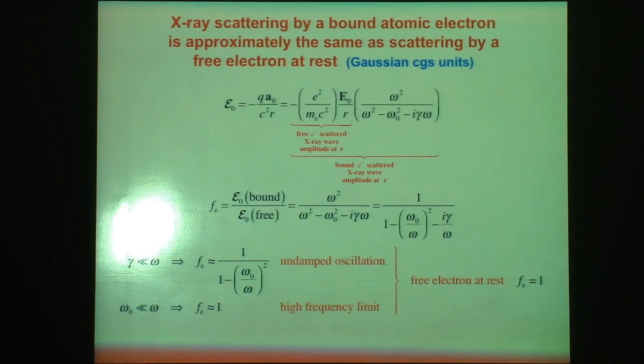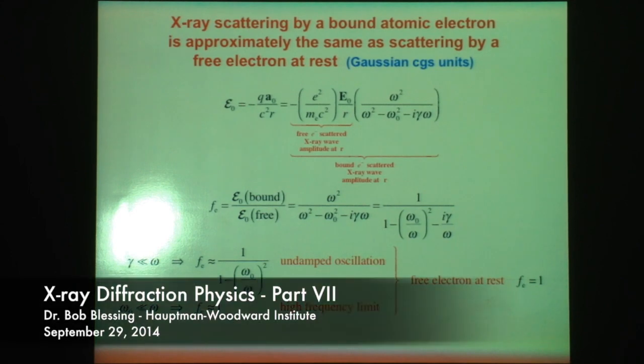Right. But they often bind in only partially, so they're in a site, maybe a uranium atom binds maybe only half the time or a third of the time. So it's like a weakened or a smaller uranium atom. And furthermore, there can be not only partial occupancy but disorder. So it typically happens that the scattering from those falls off, but it's following along pretty much the scattering by all the other stuff. It still is a big component of the scattering.